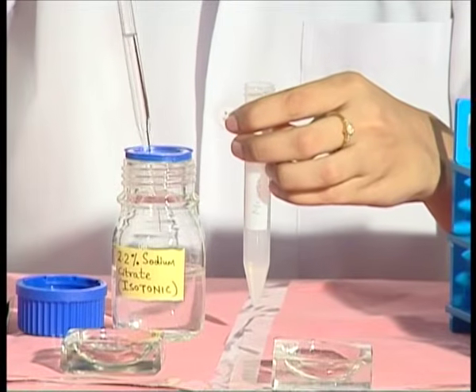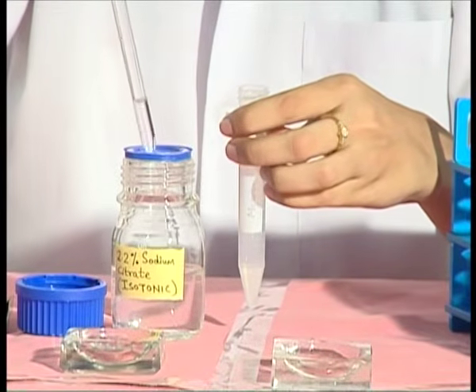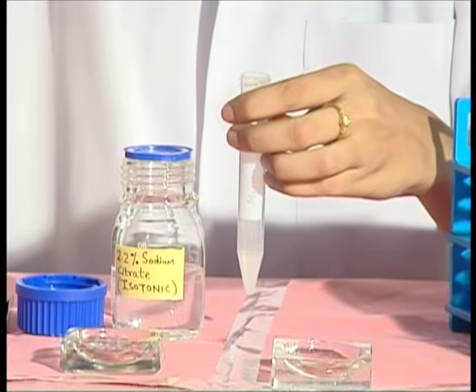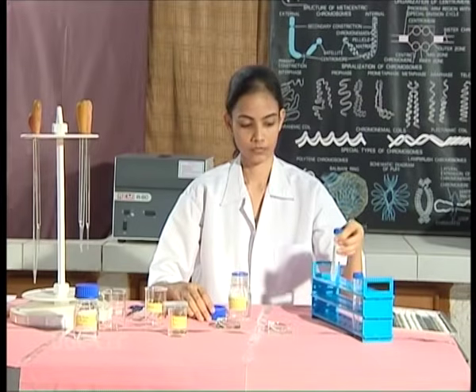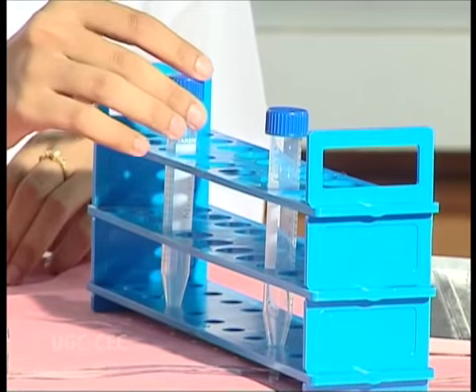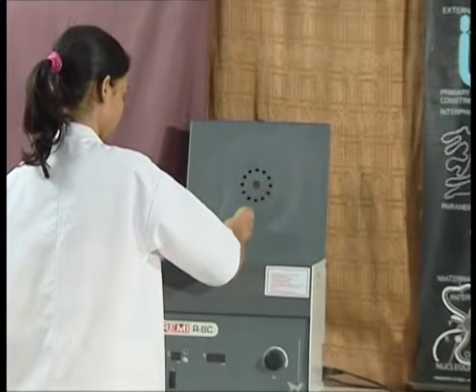Add a little amount of isotonic solution.